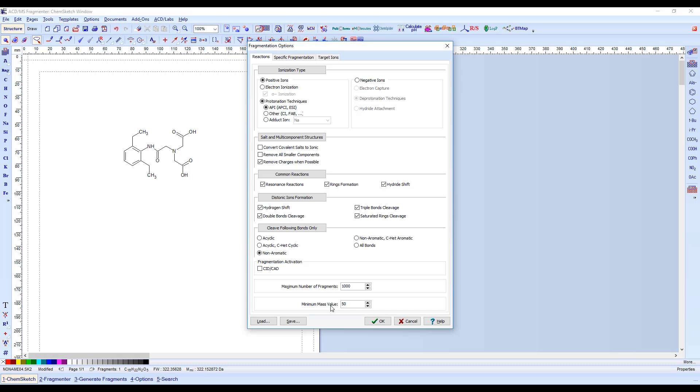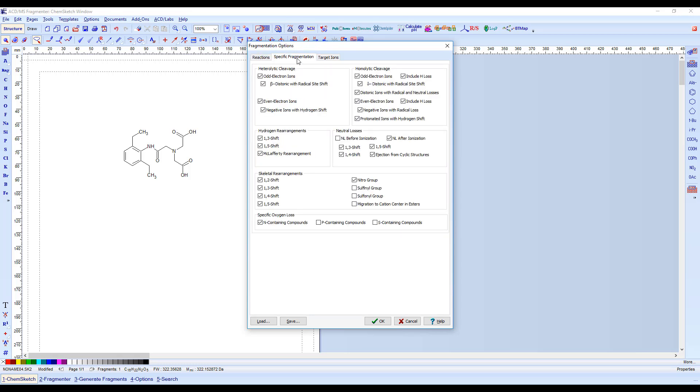The minimum mass value will set the lower limit for fragment mass. Under Specific Fragmentation, you can define the allowed fragmentation reactions based on your structure.